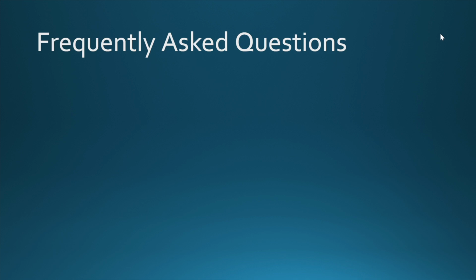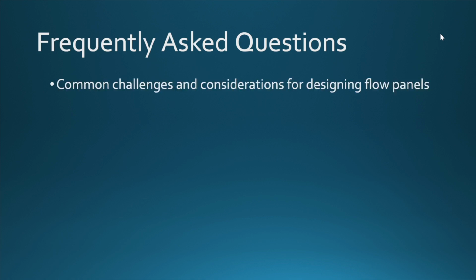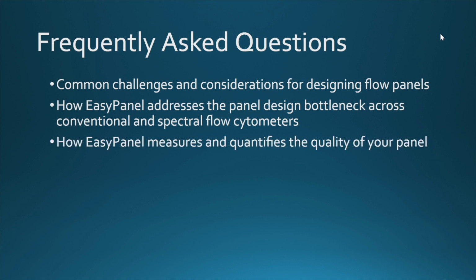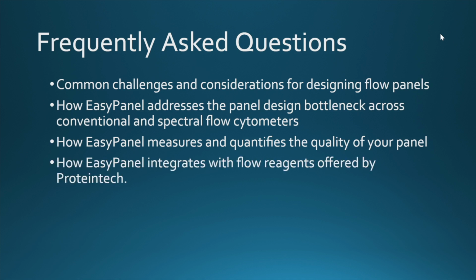I'll be doing a two-part presentation today. One, going through some frequently asked questions about panel design and EasyPanel, and then sharing the screen to go through a demo of the actual tool and designing a panel with you. So I'll try to address some commonly asked questions, including what are the common challenges and considerations when you design a panel, how EasyPanel addresses these for both conventional and spectral cytometry, but then also how do we quantify the quality of a panel, and finally how EasyPanel integrates with flow cytometry reagents offered by Proteintech.